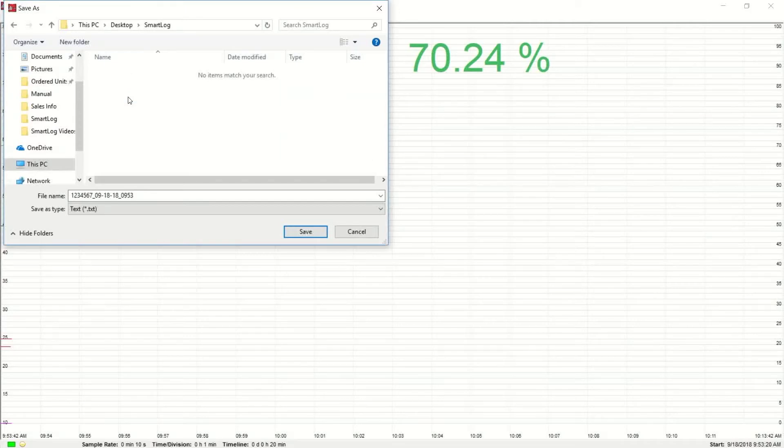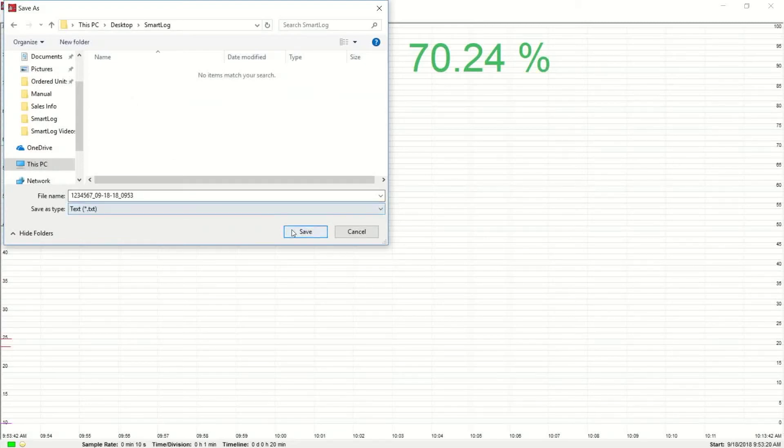The log file will automatically be named with the serial number of your parameter unit and with the date and time that the log file is created. Click Save.